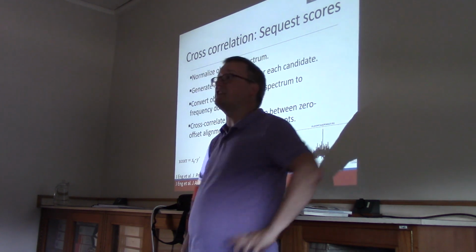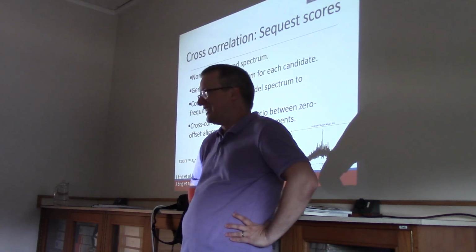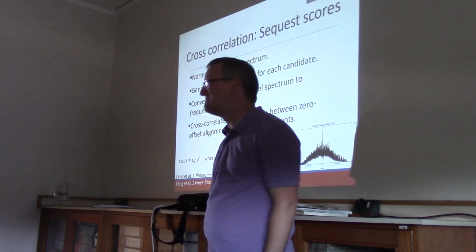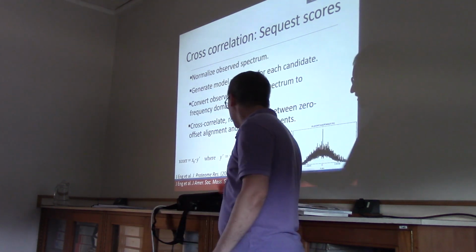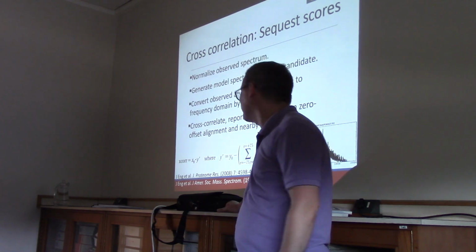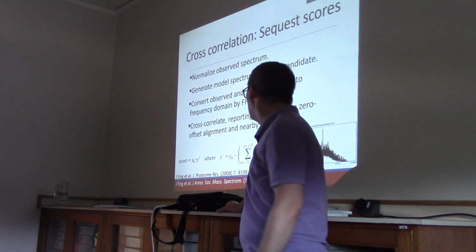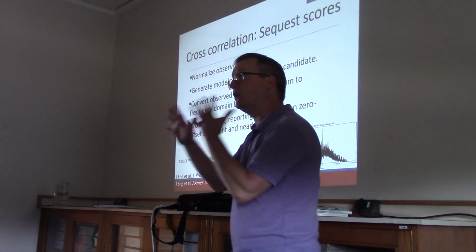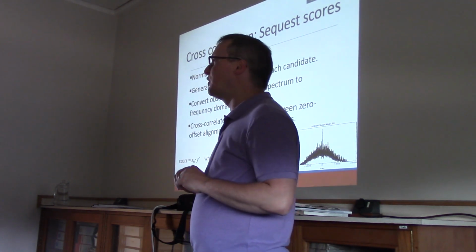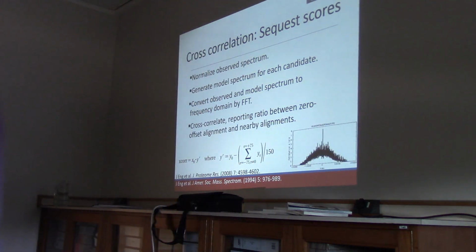Now for all the people who wasted their time back in Pentium 3 days running Sequest, this is irritating. Imagine if we could have had our search results back 10 times as quickly. Very vexing. Anyway, he did the math correction in 2008, and another search engine has resulted from that. So the Comet search engine is also freely available for everyone now. So the cross-correlation approach has shown up in a whole lot of different search algorithms out there. I wrote a paper about the family tree of Sequest that relates to all of the inheritors of this approach.